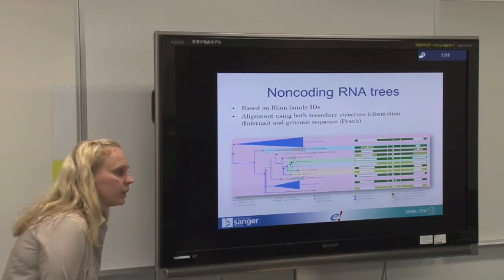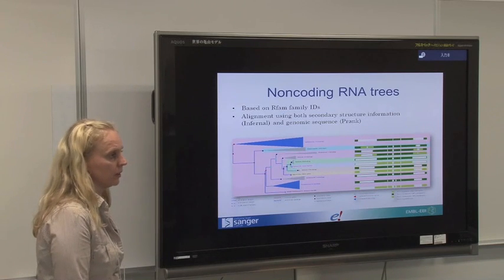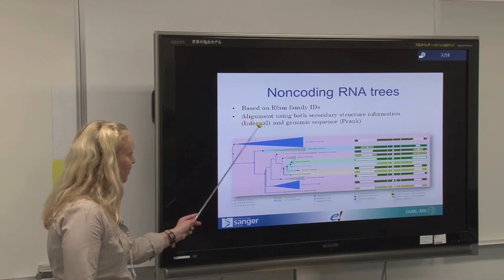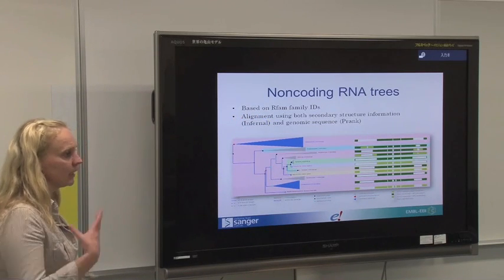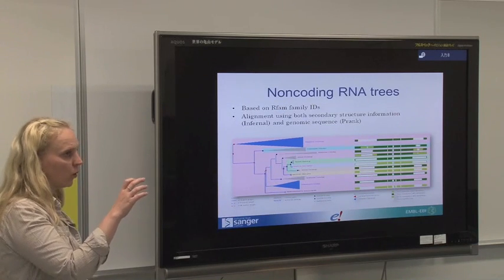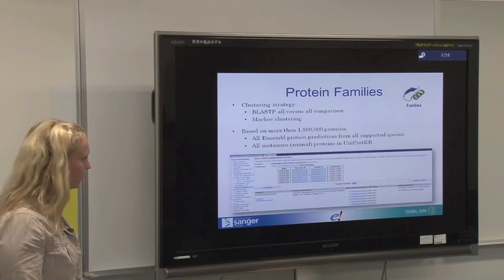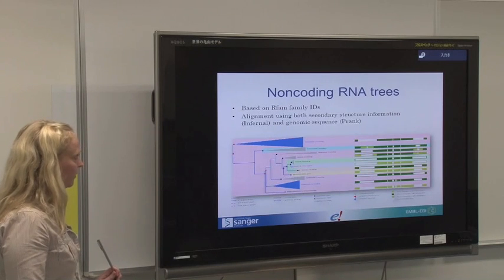You include algorithms which track the physical chemical properties and important parts of the sequence, whether they're there or not. But the details are calculated by a program called Infernal, if you want to explore. Basically, in addition to the conservation of the sequence, it also checks how much a change would affect the secondary structure of that RNA.